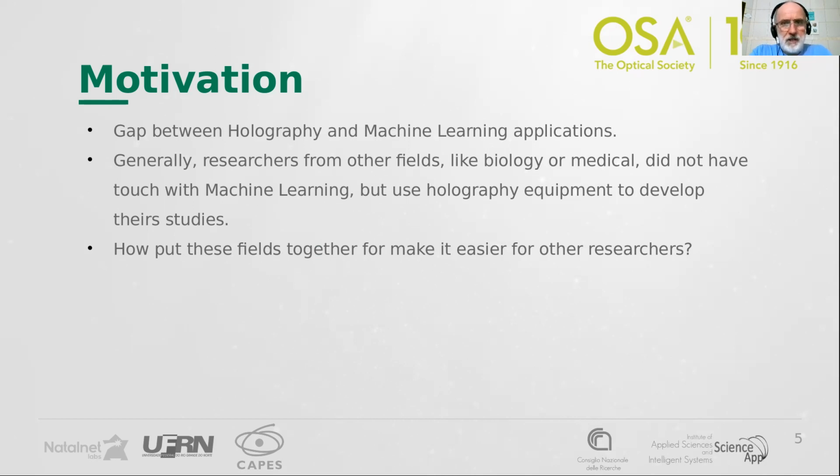And when we try to get them together, we have some problems. So what we would like to do is to put together all of this and get those researchers from biology or even medical fields also to operate the system in an automatic way.